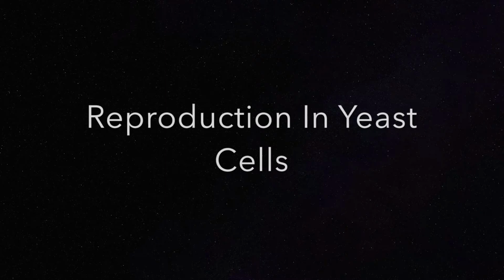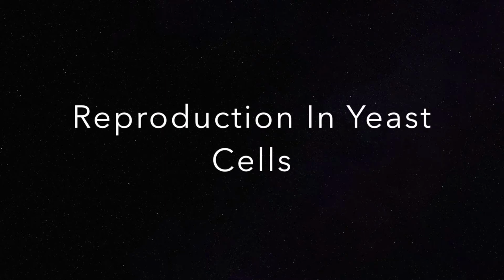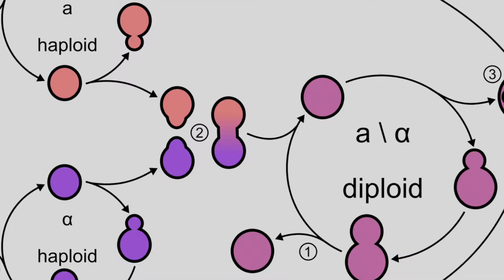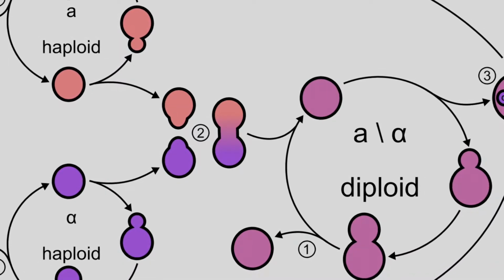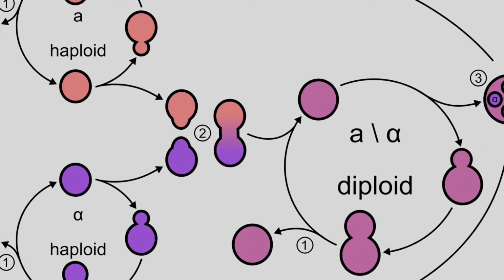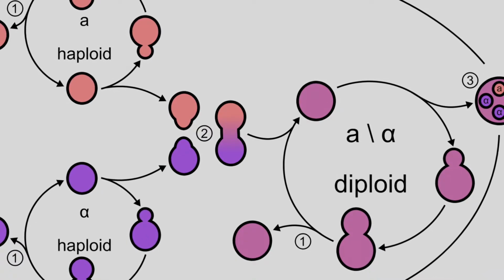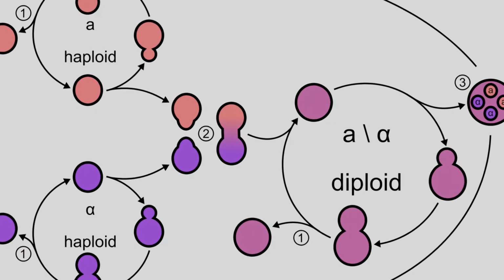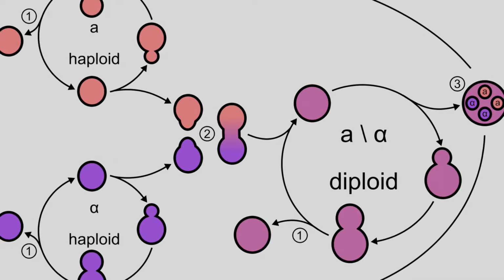For this experiment, the organism that we will be testing for complementation are yeast cells. While asexual reproduction is most common in yeast cells, we will be experimenting by crossing two haploid spores that have a mutation in the ADE pathway. Sexual reproduction in yeast involves the joining of a haploid alpha cell with a haploid A mating cell. When an alpha and A cell are physically close, they are able to fuse and form a diploid zygote. This zygote is then able to asexually divide and form a genetically identical population of yeast cells. This is particularly helpful in a complementation test because it allows for the identification of the mutations present in the parent colonies based on the color of the filial colony.